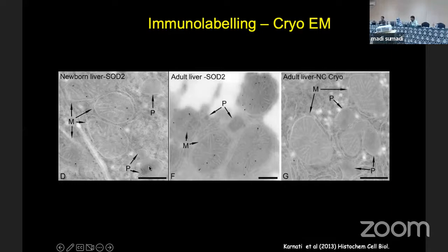And here you also see a clear structure, a black stripe going on. This is the crystalline core of the peroxisome, and this is also one way you can clearly identify peroxisomes. And this is also very nice, beautiful cryo-EM that I told you about before. It tells me a different, real texture of your organelle, because this is a fixed tissue and this is a frozen tissue. There you can see clear differences. This is the natural pattern of the peroxisome, how it looks in our body, how mitochondria look. These two are also beautiful structures. And fixation changes the texture of the organs and cell structures.